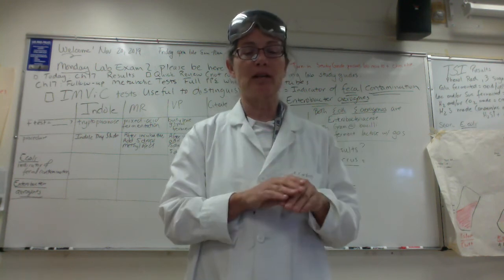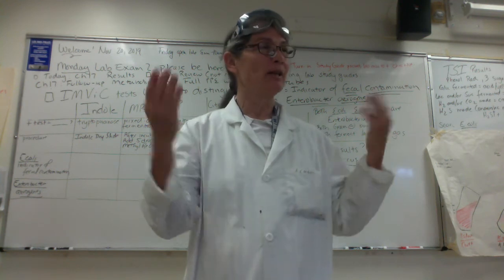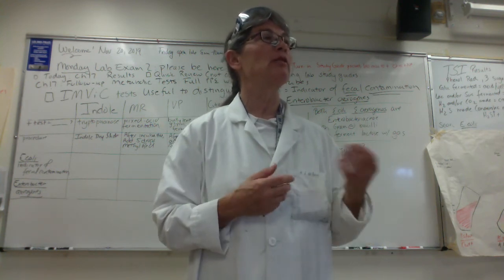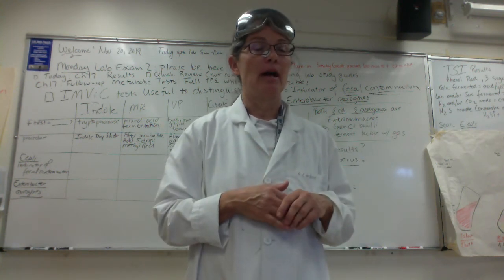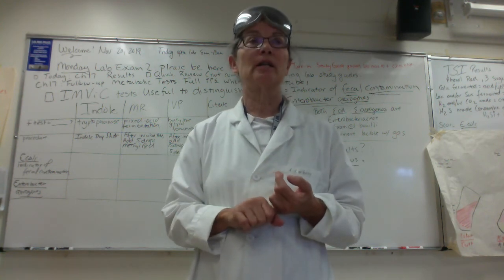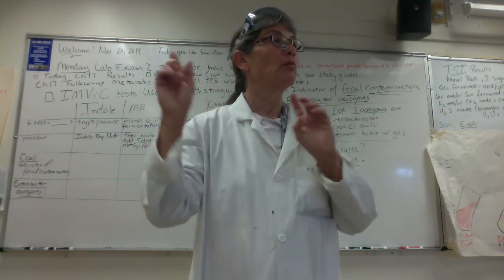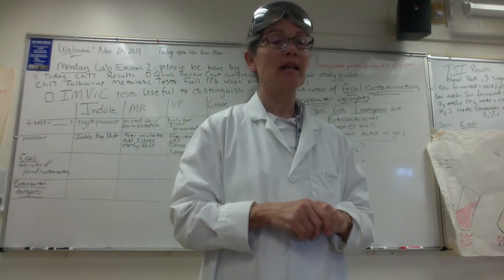Okay, so we'll stop the IMViC intro here, and then we'll let you guys get your full PPE on, go grab your IMViC tests, set them up in your test tube racks, score their appearance, record their appearance, and whether the appearance tells you they're positive or negative, and then we'll put our class results up on the board. Okay, all right.